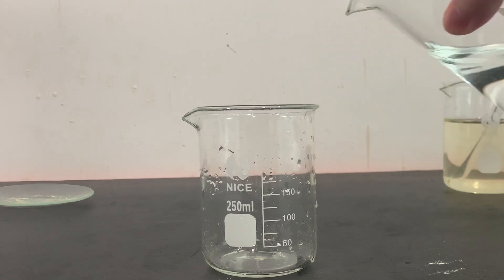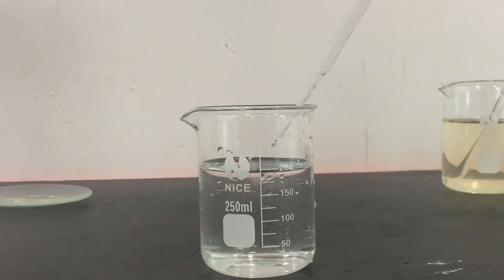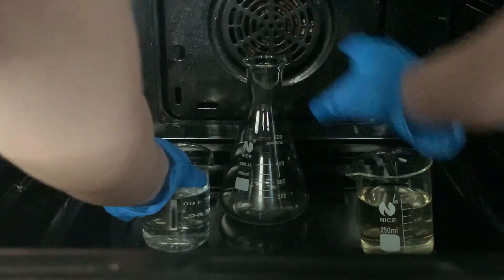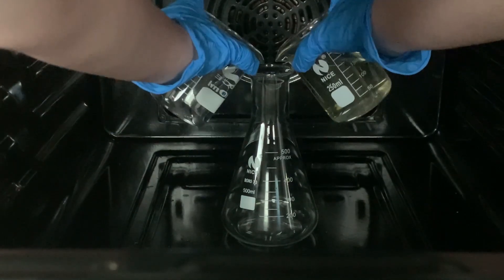To another beaker, I poured in 200 milliliters of water and added 2 milliliters of household bleach to it. We then have to mix both solutions together and we will be greeted by a blue glow from the luminol being excited.